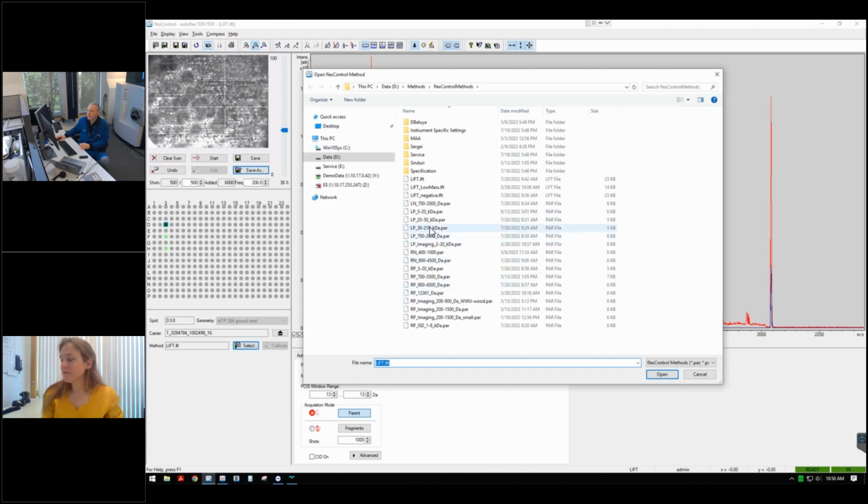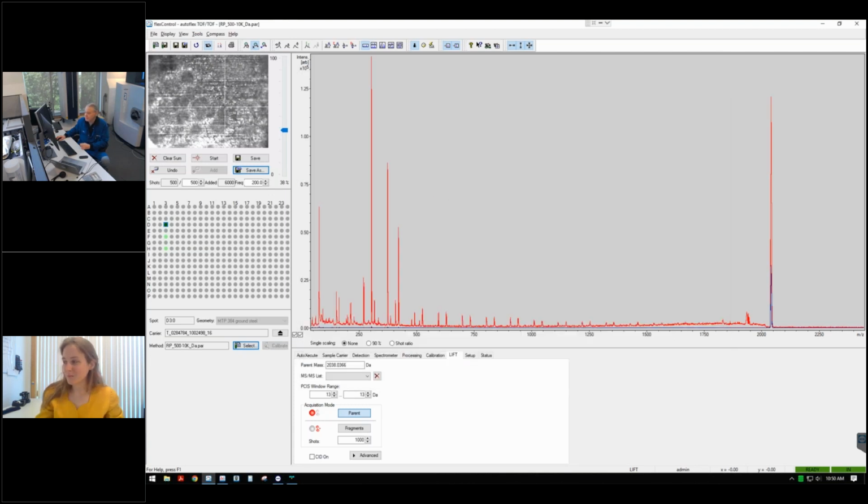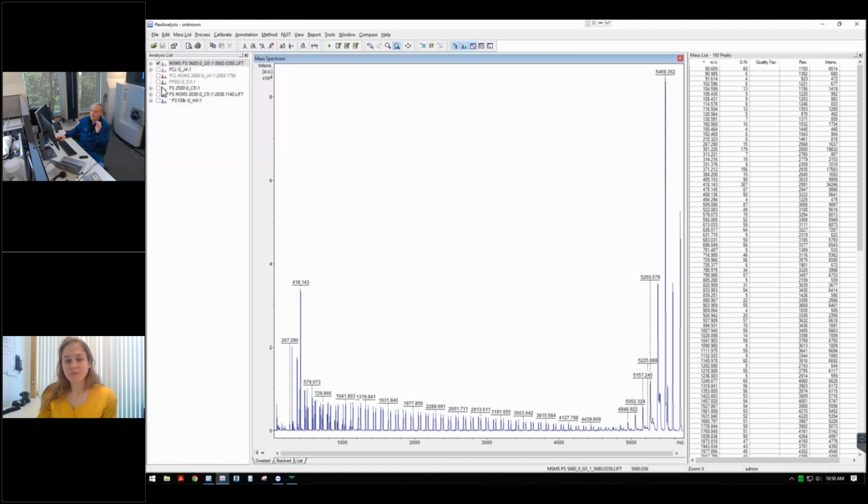Overall, there could actually be several. The biggest one is, again, what I discussed during the presentation, which would be the polydispersity. Without going into it too much, imagine that distribution. If everybody could still see the processing software, I don't know, do they have this view still? Yeah, I can still see it, yeah.